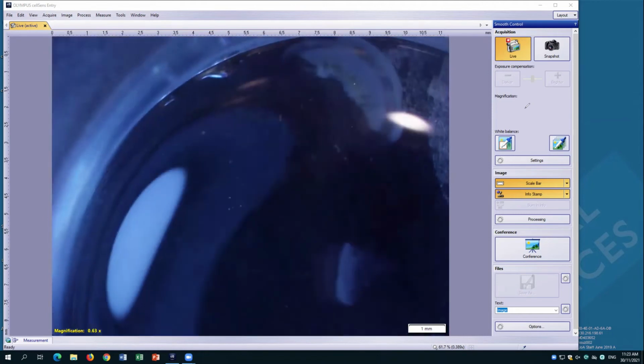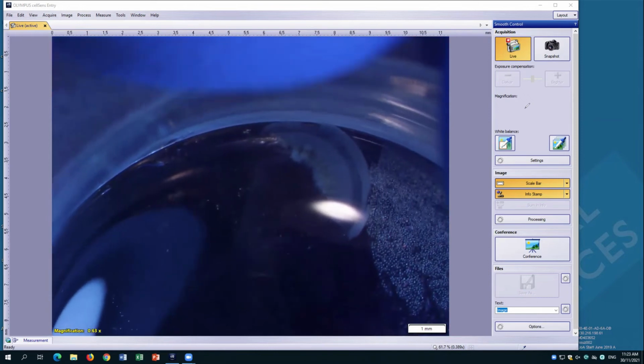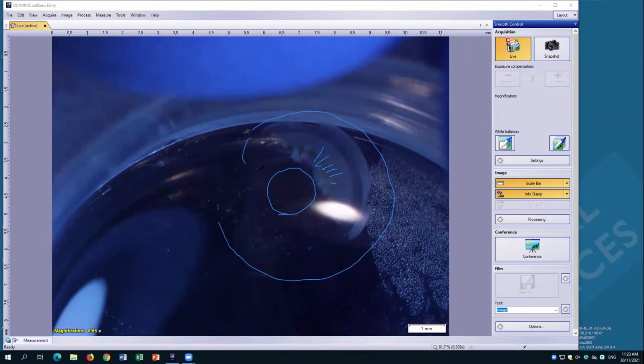mounting is everything. Now you see quite a slightly different contrast here along the way. So over here is a nerve fiber. Over here is the center of the cochlea. This was the end of a turn, and it normally goes around. This semi-transparent bit in the middle is where the sensory cells normally reside. So your organ of Corti and basilar membrane of the cochlea is here. And the vasculature of the spiral ligament lives around here. And the organ of Corti here.